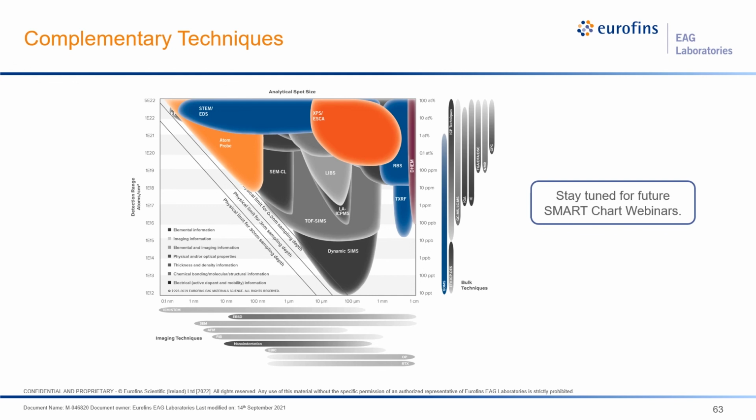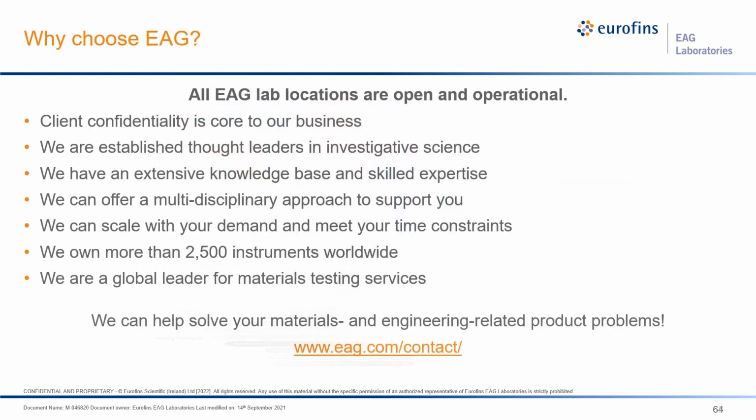For surface impurities, we combine it with TXRF. But as I said before, STEM EDS is one of the techniques that we use in combination with SIMS quite often.